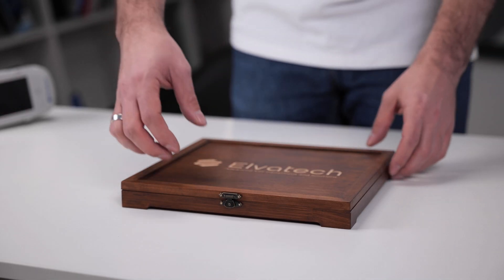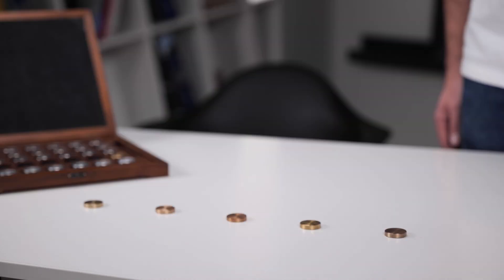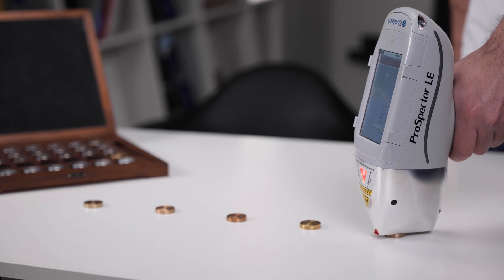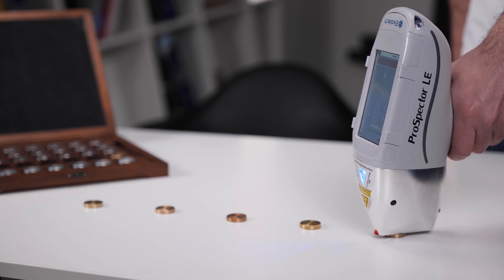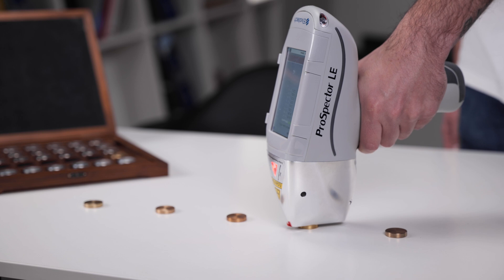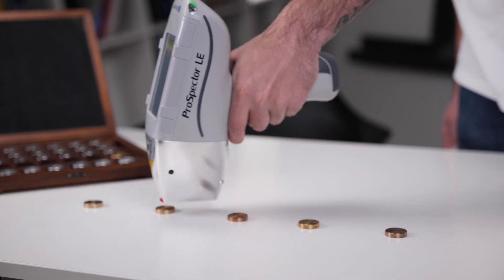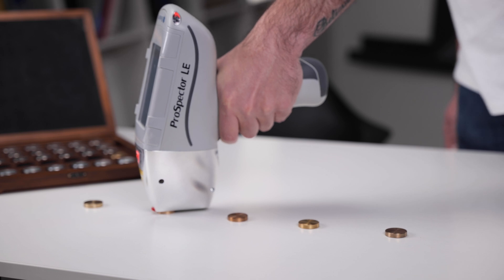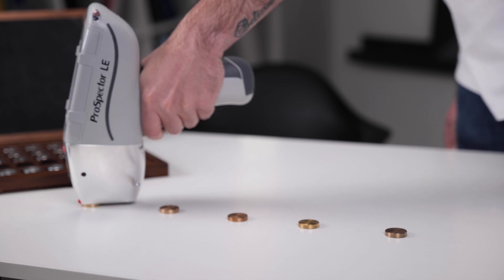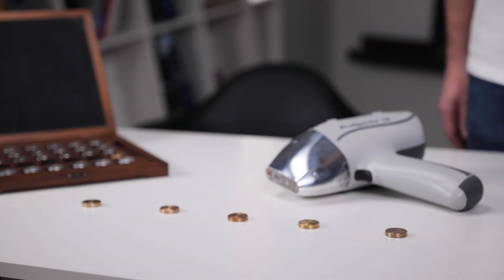The Prospector 2 allows you to perform elemental analysis of an alloy, accurately determining its composition and concentration of elements. You can also use the comparison function to compare the alloy to a predefined reference and get a quick result about its compliance. The pass and fail sorting function allows you to quickly determine if any alloy meets certain requirements or criteria.